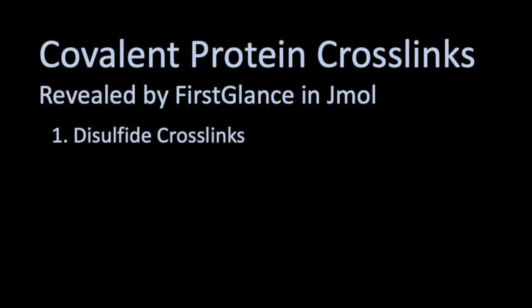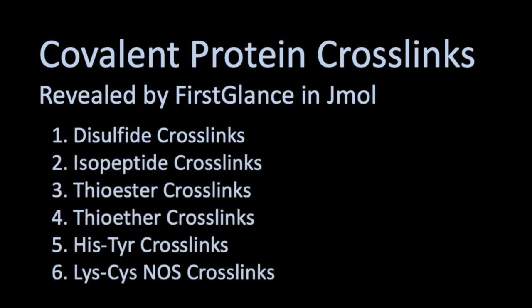Probably most of you are familiar with disulfide bonds as crosslinks between linear protein chains. In addition to disulfide bonds, FirstGlance will alert you to the presence of five other kinds of covalent protein crosslinks.